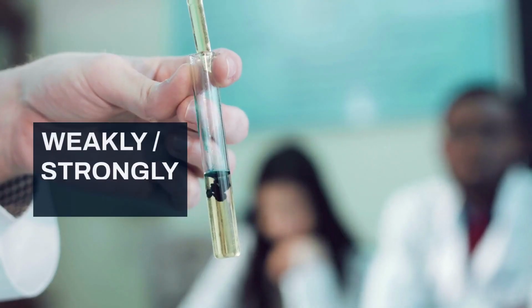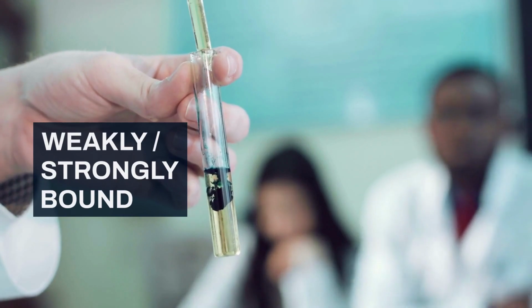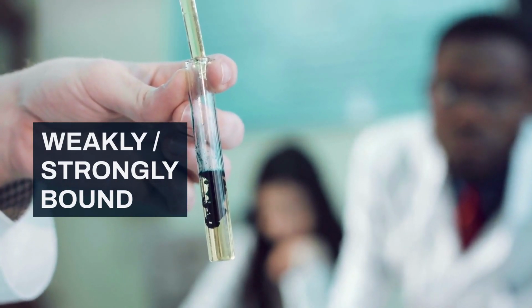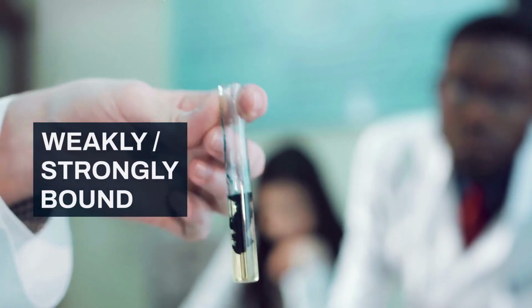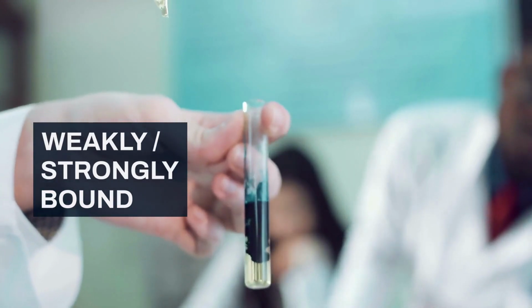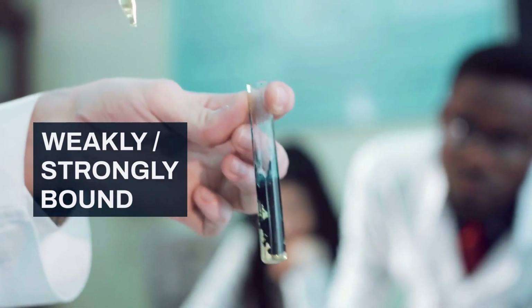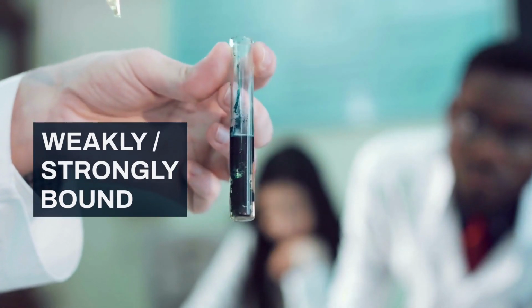Weakly bound molecules will elute first, at lower salt concentrations. Strongly bound molecules will require higher salt concentrations to be released from the column. Therefore, peaks appearing later on the graph, at higher salt concentrations, indicate molecules that bound more tightly to the column.